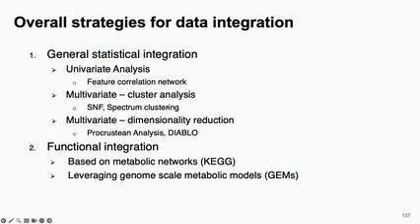Then there's the multivariate cluster analysis. If you are familiar with machine learning, precision medicine, and multi-omics, then there's similarity network fusion, spectral clustering. So there are several different things. You identify some clusters, similar samples close together. But why they're similar is usually non-linear. So SNF, or spectral clustering, is not linear. So it's very hard to intuitively understand why, because the underlying feature is not a linear one, but it's very robust, with good performance.